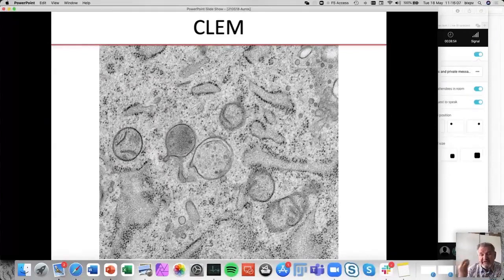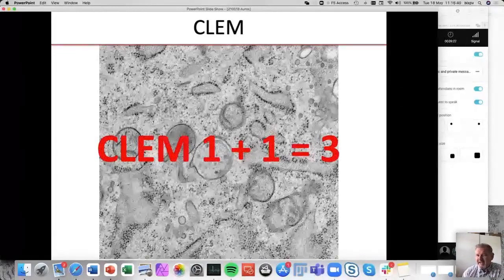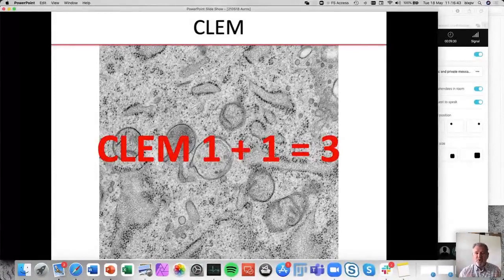Electron microscopy, of course, gives us this higher resolution. But for instance, if we look at this endosome here, it has a tube sticking out. There's another one here that is sticking out. From this one static image alone, we will never be able to determine whether that is actually moving away or is fusing with this endosome. And so by bringing light microscopy and electron microscopy together, we really say 1 + 1 is 3, because you get more information than you would get from using both technologies in a separate workflow.